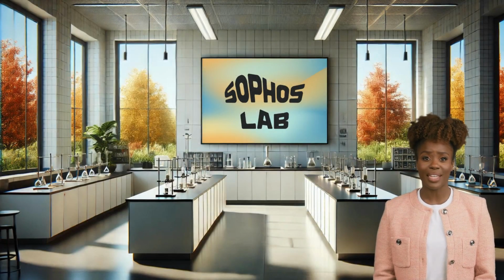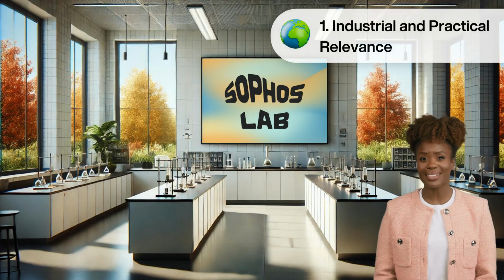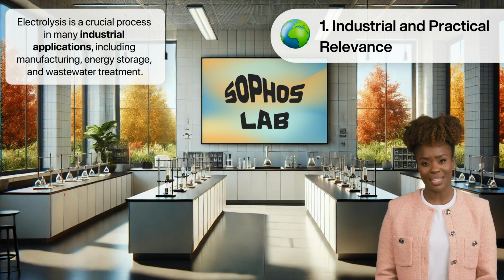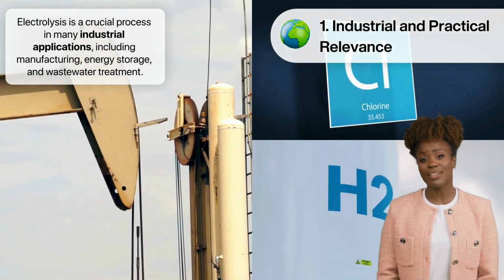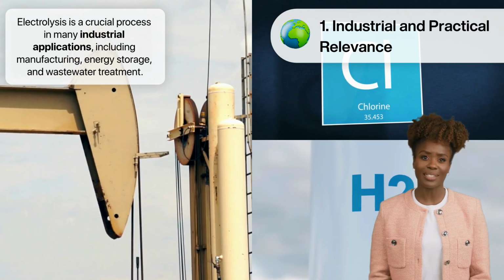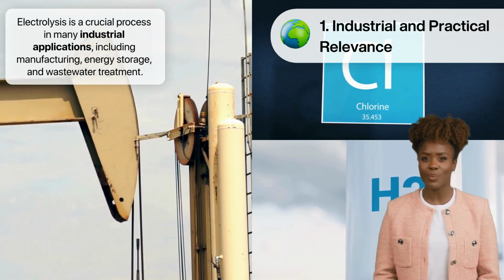We're almost ready to dive into the details of the practical, but let's quickly explore why this experiment is useful. First, let's discuss the industrial and practical relevance. Electrolysis is a crucial process in many industrial applications, from the extraction of metals to the production of chemicals like chlorine and hydrogen. By understanding what happens during electrolysis, we gain insights into processes that are vital for manufacturing, energy storage, and even wastewater treatment.